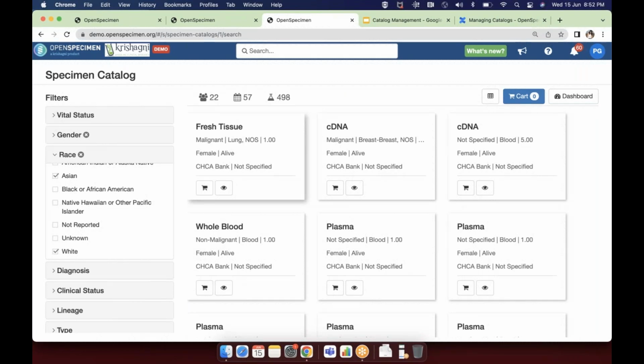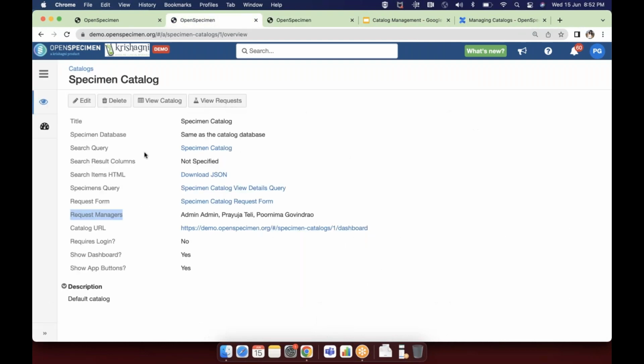So, in this card view, what columns to display and how each card should be displayed is controlled using this particular configuration. But if you don't configure this, by default, it will always display as a table view or a grid view. So this is not a mandatory thing.